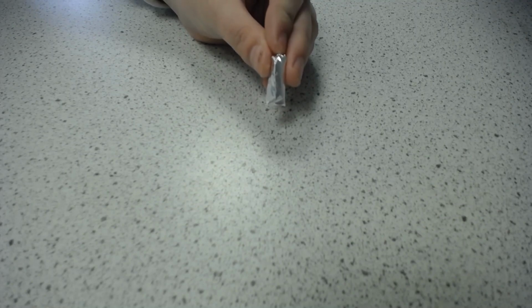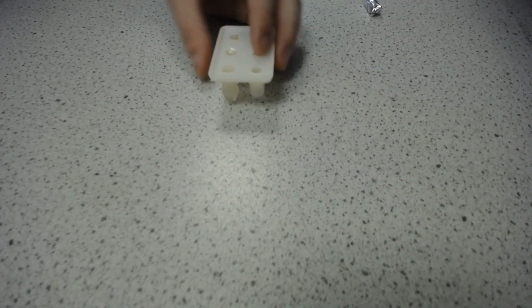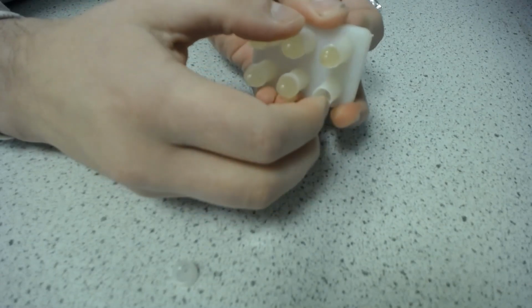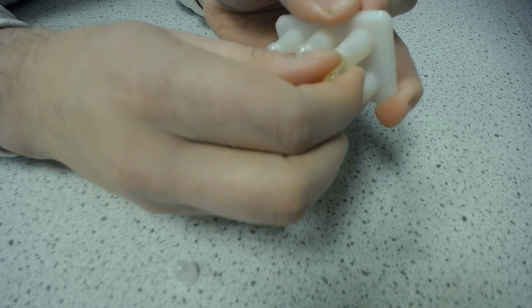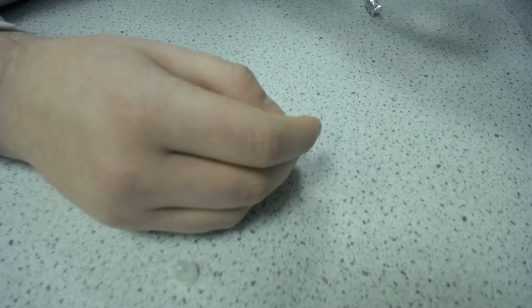Okay, so obviously you can pause, stop, go back and repeat that if you like, but essentially we've taken it out of there, we've gently taken off the cap, given the suppository a little push from behind, and then gently forwards and backwards, trying not to split the suppository, coaxed it out. Okay, and that's what you need to do to take it out and then put it in the foil wrapping. So there's just a few things to think about with suppositories before we move on, and I'll let you go.